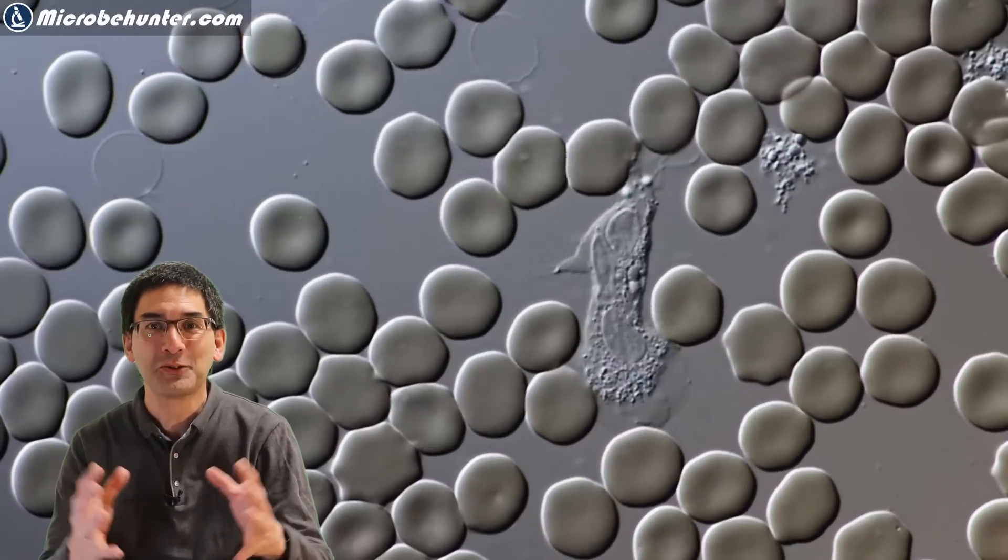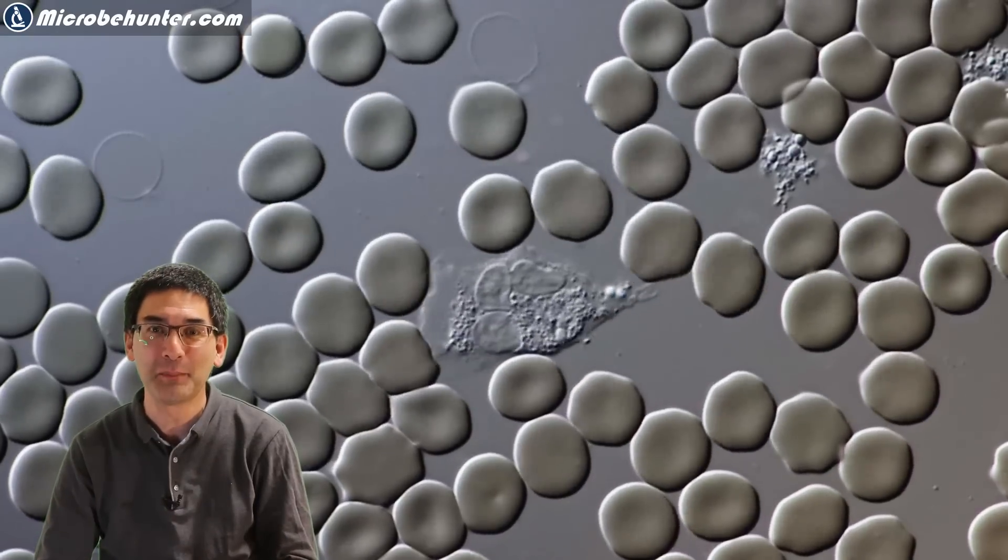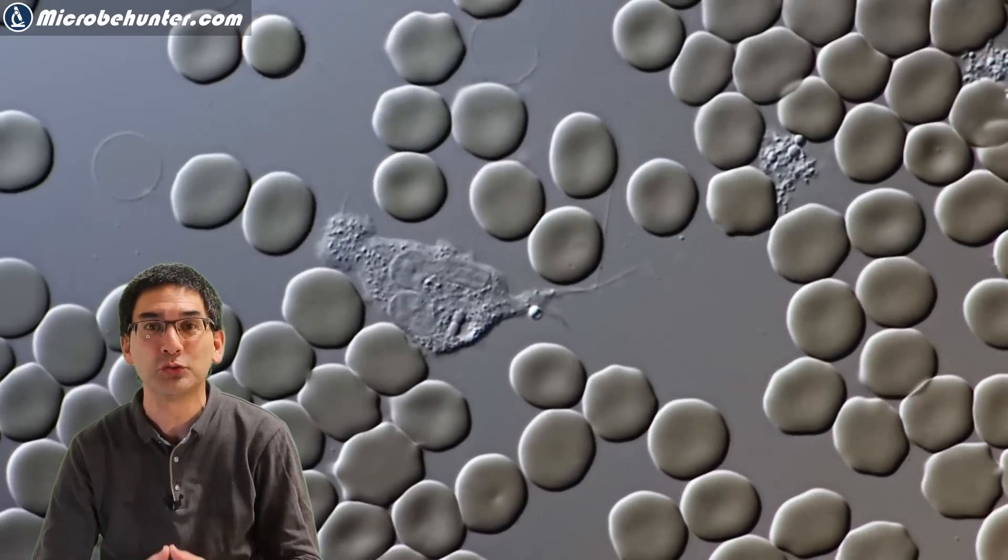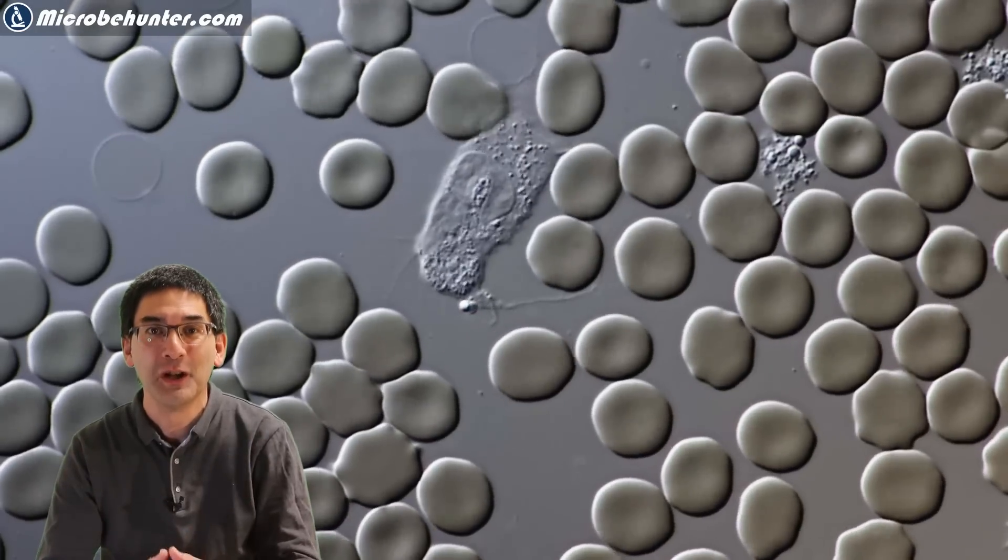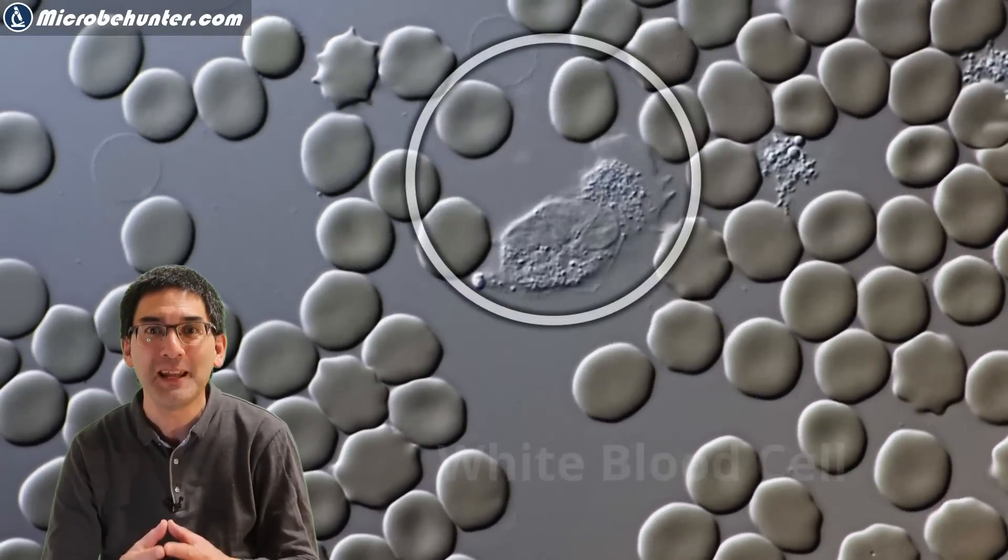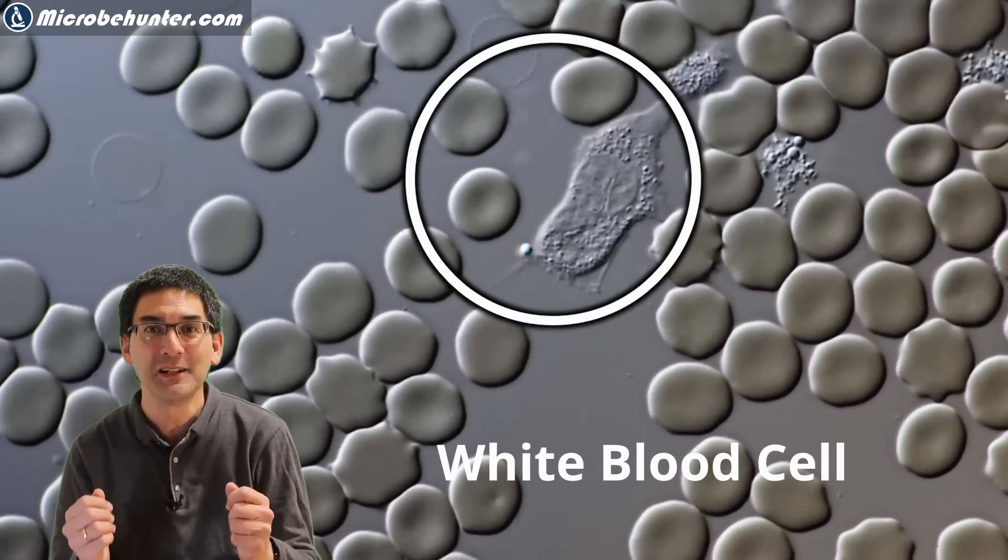Hi, microbe hunter here again. Today we have blood under the microscope, but not only red blood cells like you see over here, but also white blood cells, specifically phagocytes. These cells are part of our immune system and they eat up bacteria.